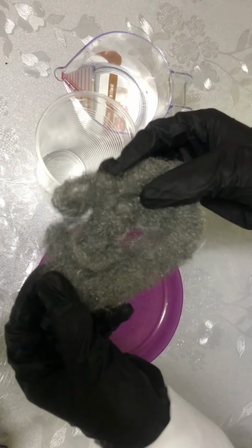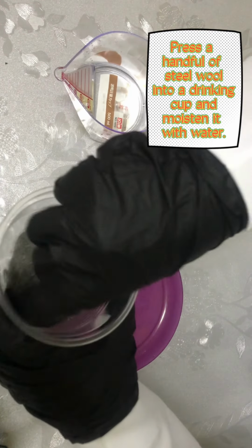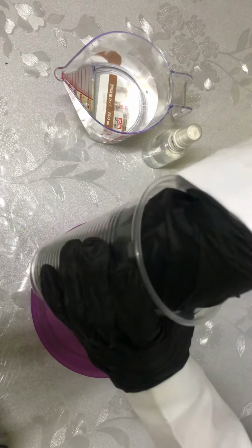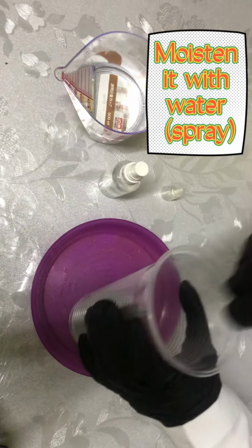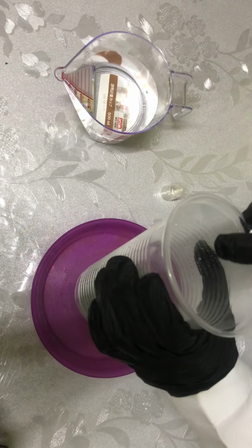And once the steel wool has become like this, press a handful of steel wool into a drinking cup and moisten it with water. I'm using a spray to moisten it with water so that it will be easier.